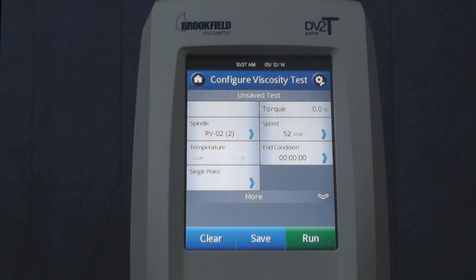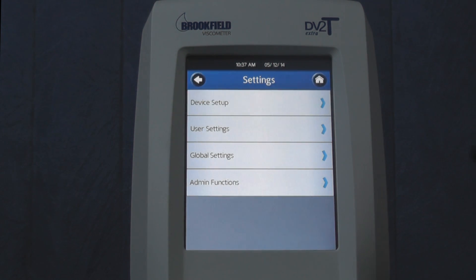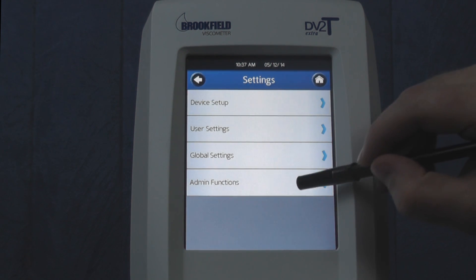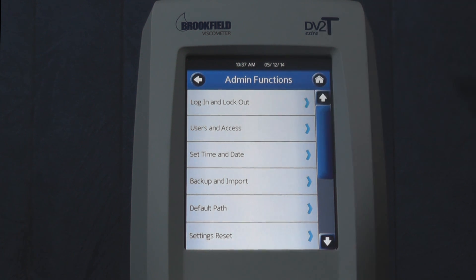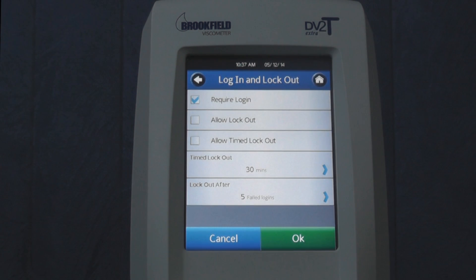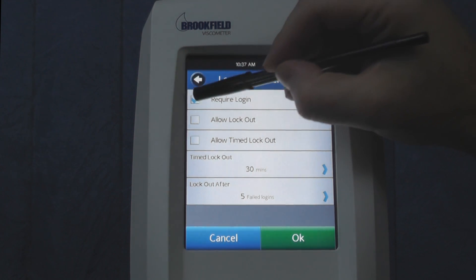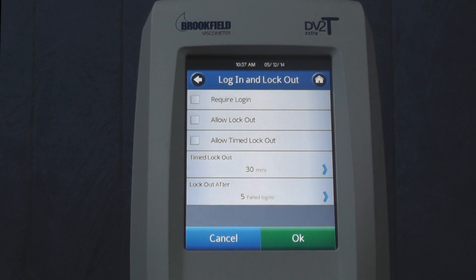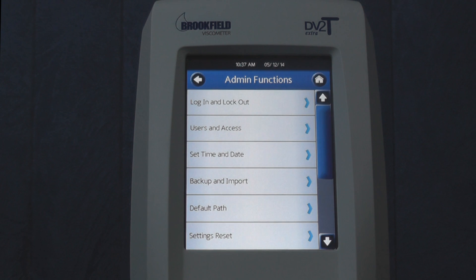You can turn off the login requirement the same way as before by simply pressing the Settings icon in the top right corner, going to Admin Functions, and then Log In and Log Out. Pressing the Require Login checkbox will turn off the login requirement and you will not be forced to login.